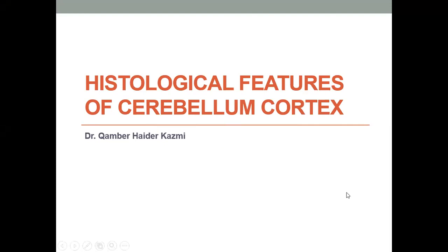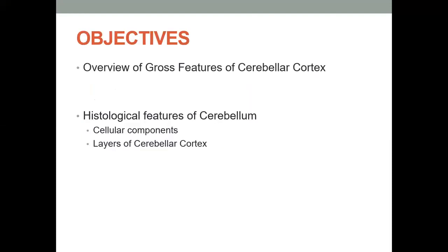This is basically histology practical. But let me just give you an overview of what cerebellar histology is, and then I'll show you the slides which are present in the histology lab at Ziauddin University. So in case this comes in the paper, you'll be able to identify them. We'll extract some identification points if they ask you to write, and I'll also tell you what they can ask you in the exam.